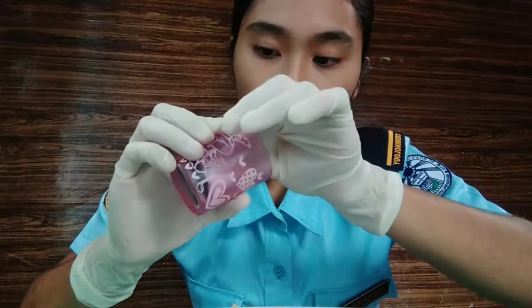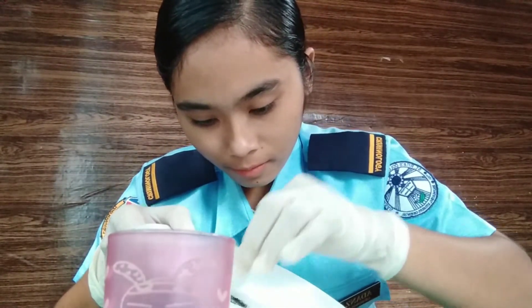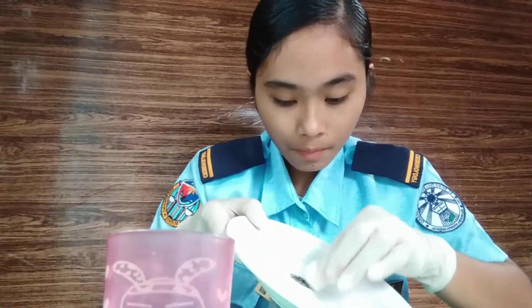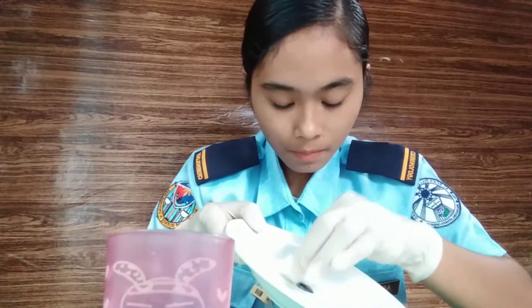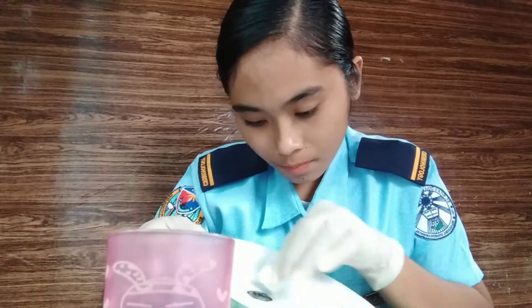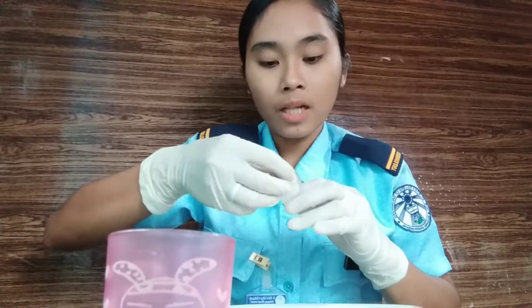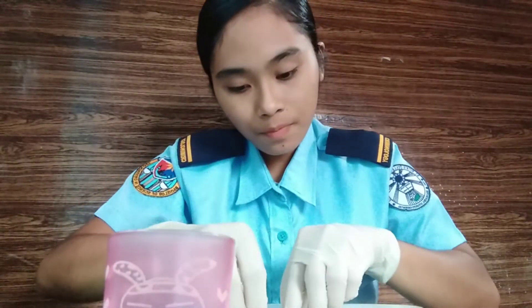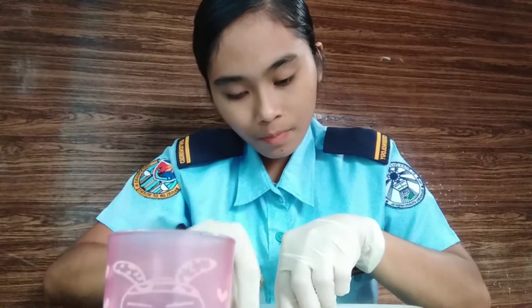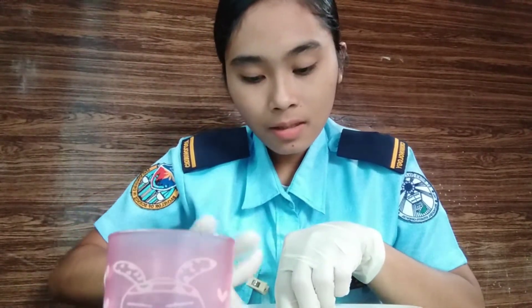Just dab it a little bit and then rest gently. Afterward, we are now going to lift it with the help of this — the scotch tape. Press it again, but gently.